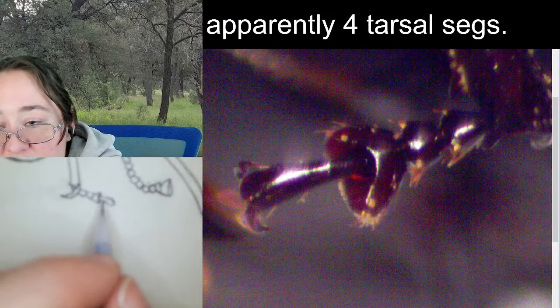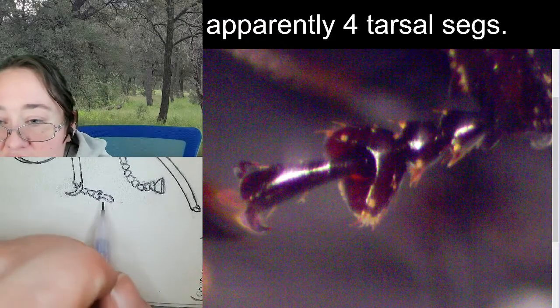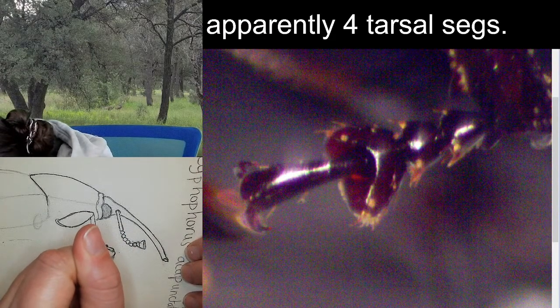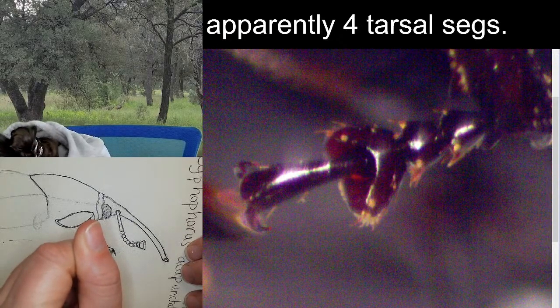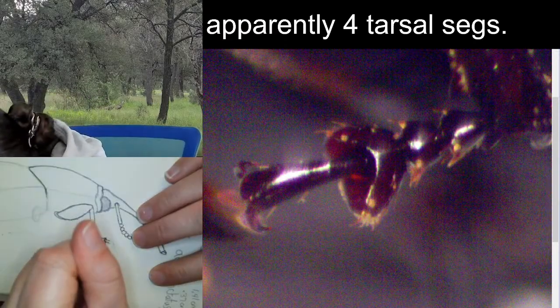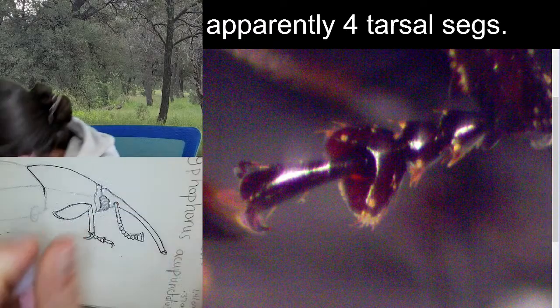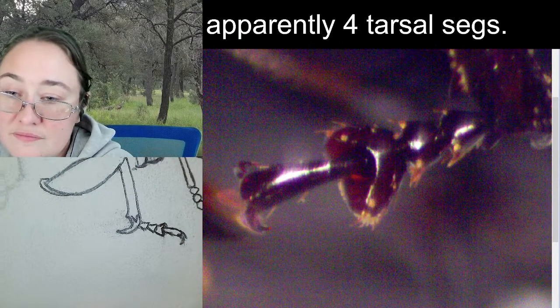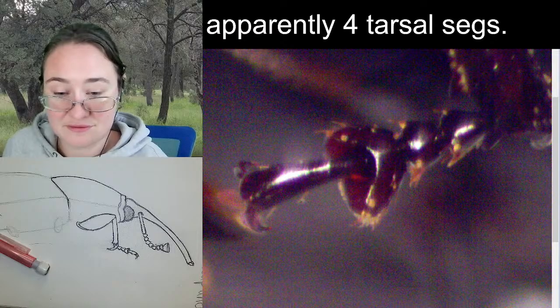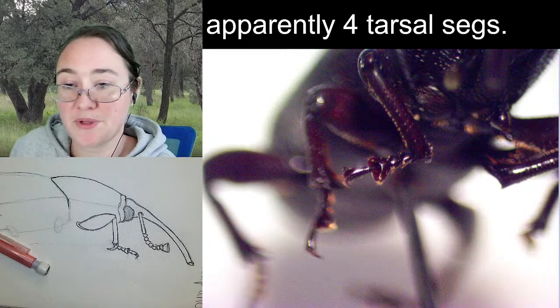If I draw that fifth segment at the end, I can also kind of finish this third segment by darkening around it to make it look like a cup. And then you've got the tarsal claws at the end that come out. Tarsal claws. All right. Alrighty, so that is our first leg. There we are. We're going to be moving on.